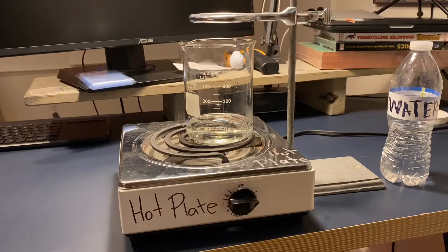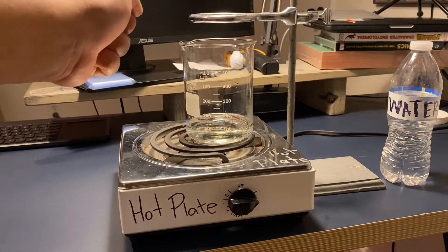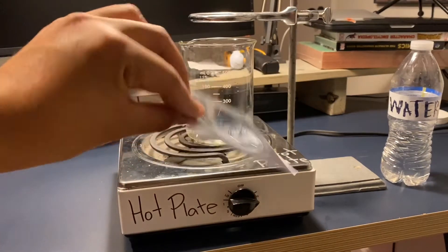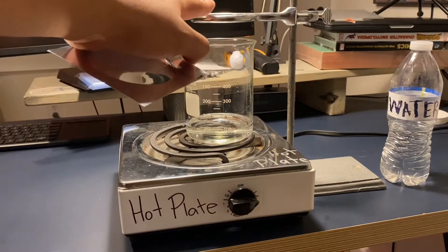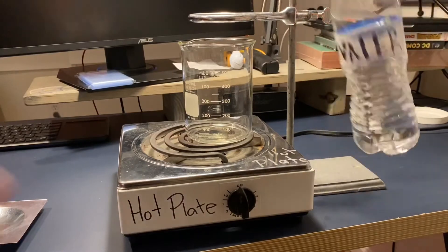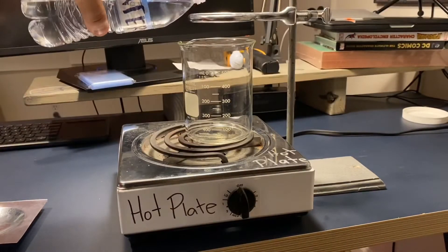In this experiment we're going to convert water into a gas and then back into water by using a piece of concave convex plastic, a hot plate, a beaker, ring stand, and some water. I'm gonna grab my water and pour about 100 milliliters of water.